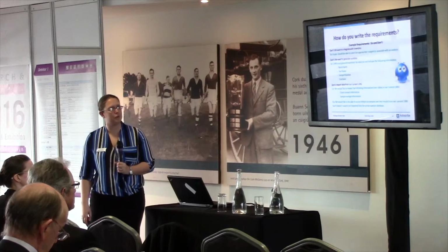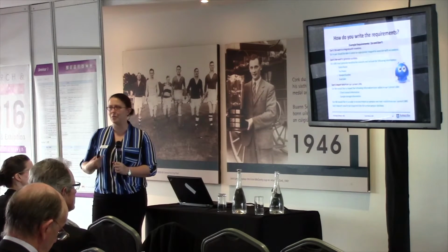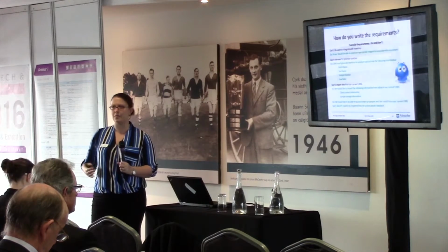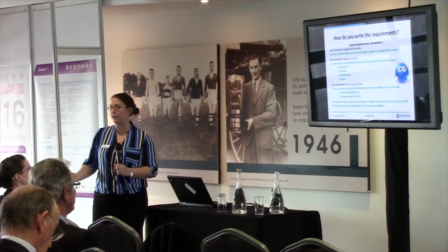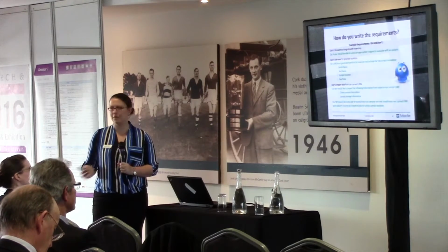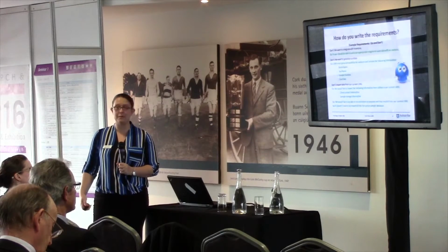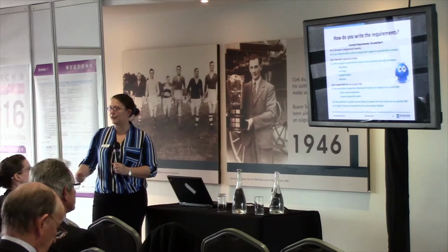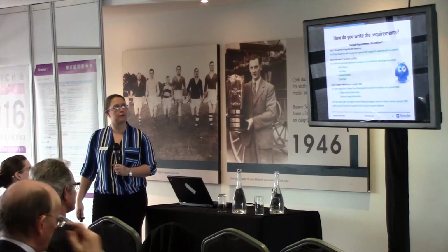And we've got, I want to import data from our current LIM system. Okay, what is the system? What information is it holding? If you were to send over a tender document with just that sentence, that's great, but nearly all of us will have to turn around and say, okay, what information are you pulling across? It might be the case that you don't need all that information that's in your current LIM system. Can we actually just use our system to interrogate that data further down the line?